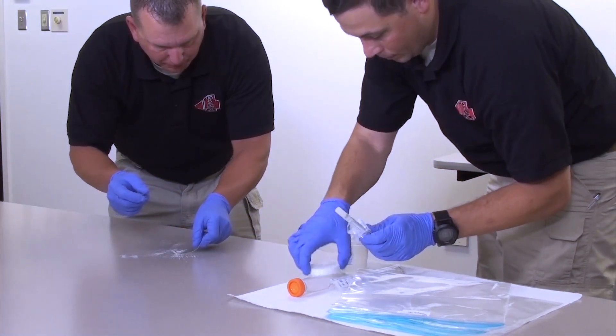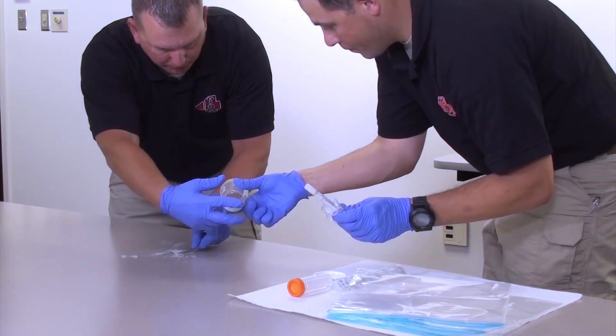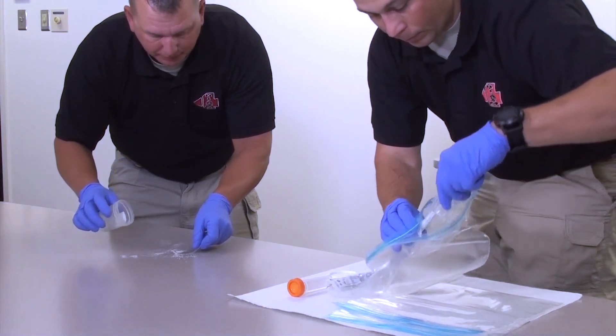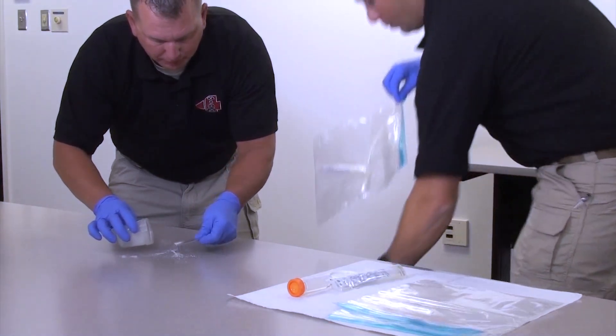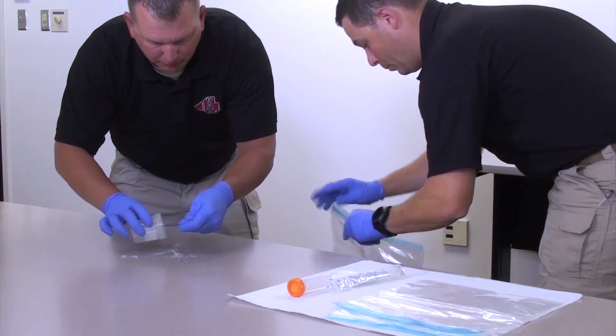The sampler closes the tube by pushing on the swab until it clicks securely into place. The facilitator re-opens the sample container labeled powder sample and hands it to the sampler. The facilitator places the tube containing the swab into a plastic bag labeled dry swab, then decontaminates the outside of the bag and places it into a transport container, allowing a contact time of 10 minutes.